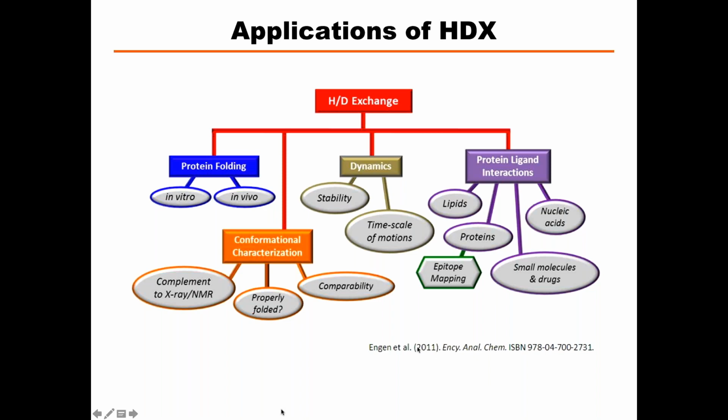taken off over the years. From protein folding studies, which I'm not really going to talk about, I give one example on IL-1 beta. Protein ligand interactions, that's predominantly what we're doing here within the Hive and what our lab is doing in general.